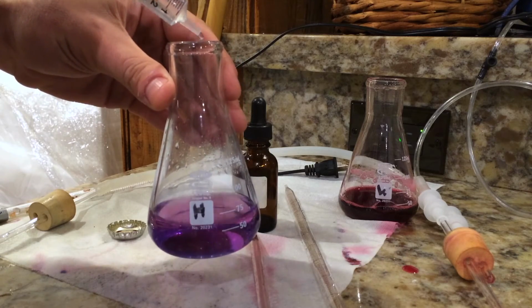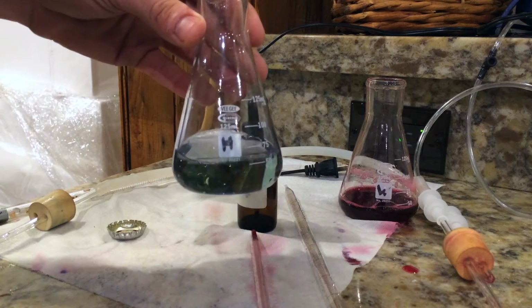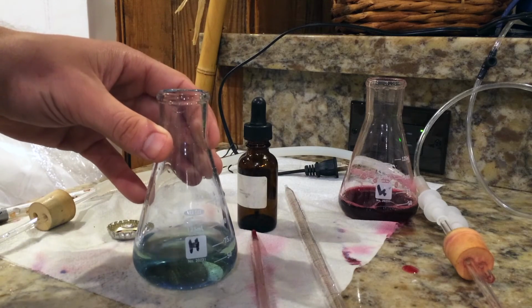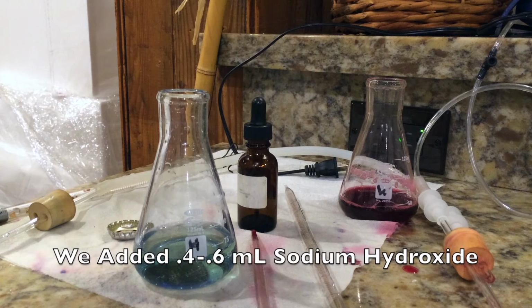And just add it real slow. I think I have an idea of how much is going to be in here. Well, less than I thought. So I only added a couple drops there, meaning there's actually hardly any free SO2 in our wine right now. So it's a good thing I checked it, because I definitely need to add some more. So I added 0.6 milliliters, and the color change happened a little bit before I was finished actually, so it's probably more like 0.4.